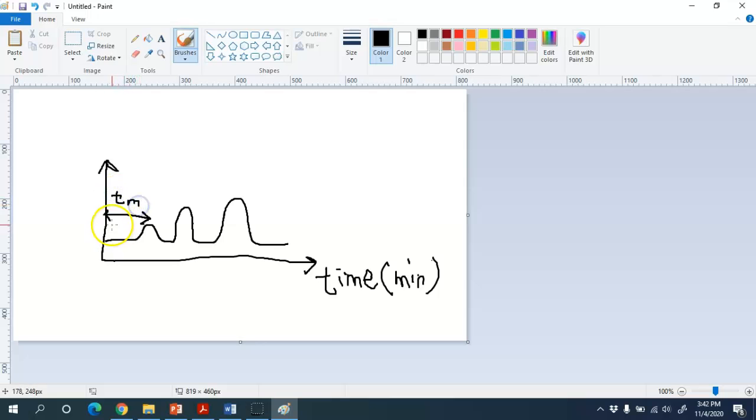And you need to state the value of the peak width. For tM, there is no peak width value, but the value for the retention time of tM, the compound which is called unretained, is 0.3. This one is the value for the unretained species. Sorry, 0.3.